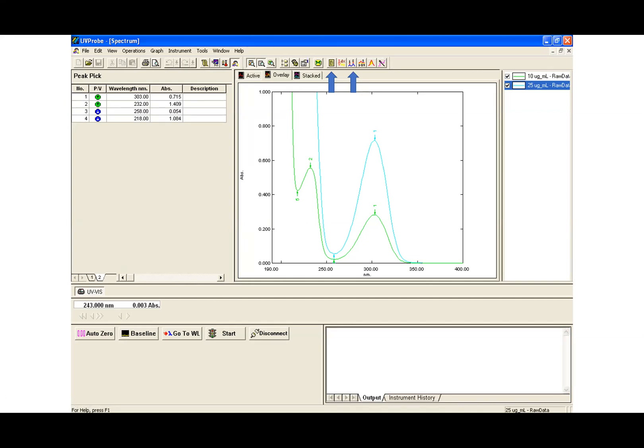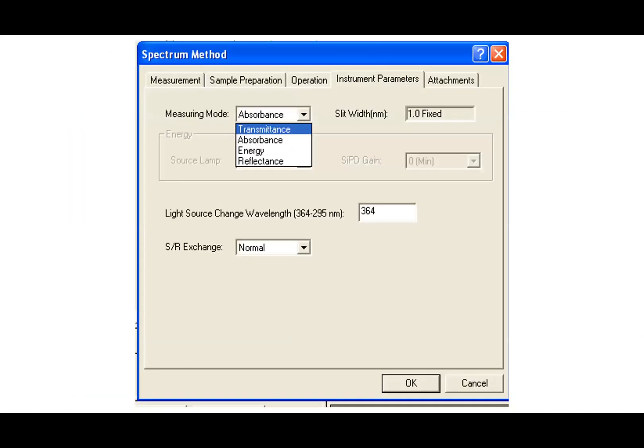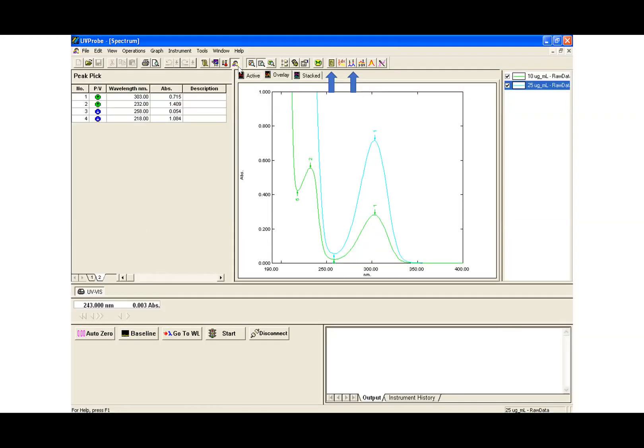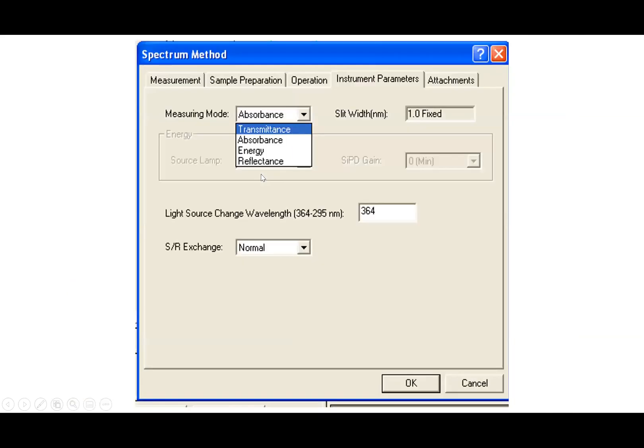There's also this other window that you can access under Spectrum Methods, and you can change the measuring mode. You can do absorbance, transmittance, energy, or reflectance. I typically leave it at absorbance.